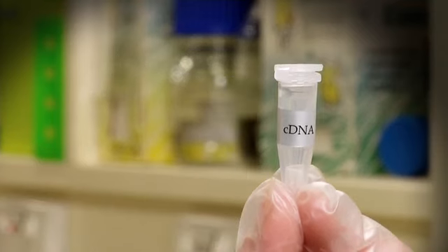So after all that hard work, we've finally got cDNA copies of all the genes that are expressed in the cell. What we need to do next is copy just the gene that we're interested in. And to do that, we commonly use the incredibly powerful technique called the polymerase chain reaction, or PCR for short.